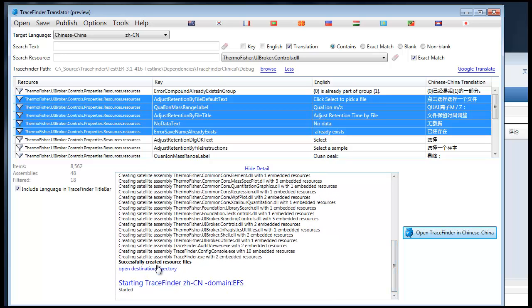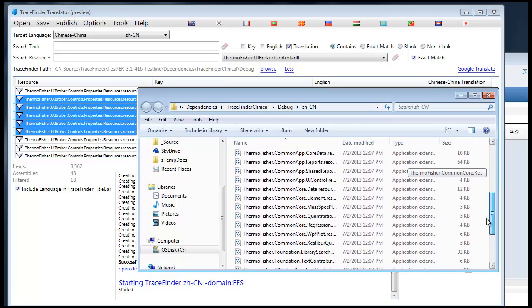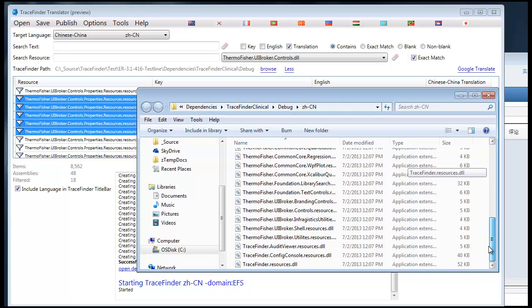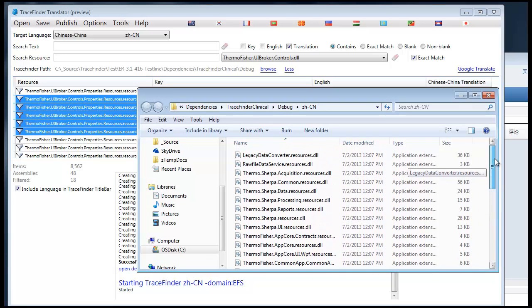You can also open up the directory in which TraceFinder Translator places those translation DLLs.